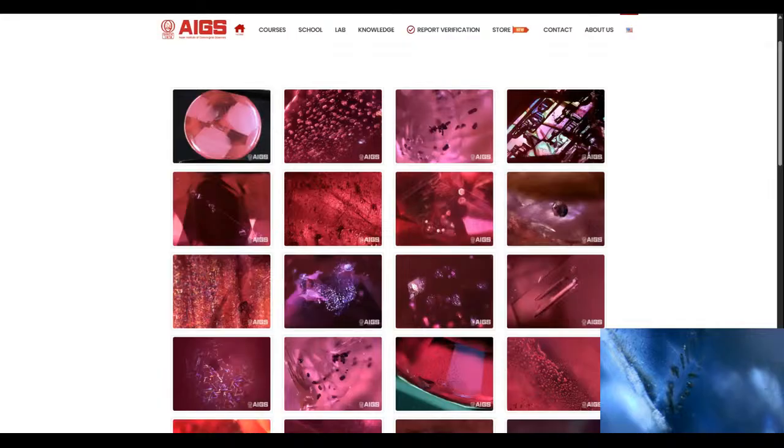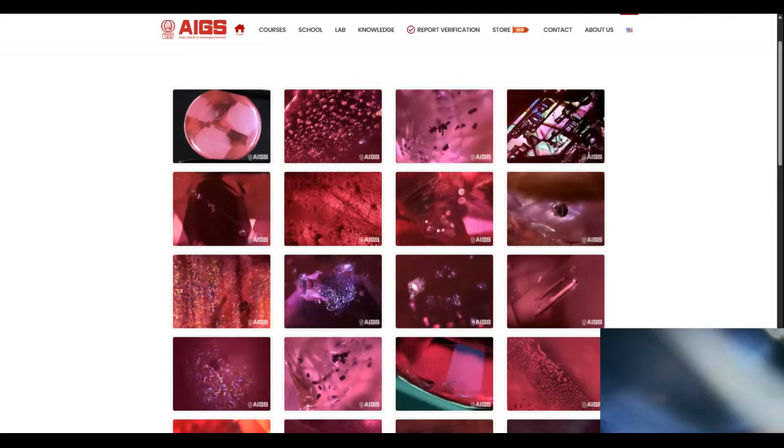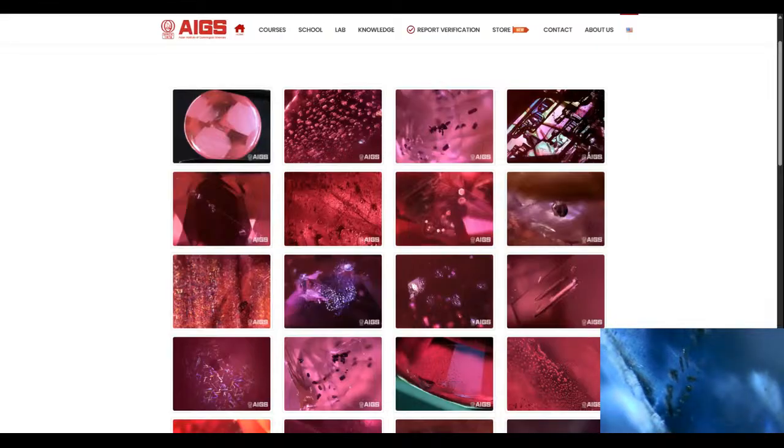Yeah, optical microscopes are obviously better in terms of giving a cleaner image, right? They are much better in visibility, making inclusions visible, but you don't need it. If you show this to a gemologist, you're like, what is this? Wow, that's a clean image. I can tell those are negative crystals that are untouched, and this is an unheated stone. Congratulations. There you have it. This is all you will ever need to know about this inclusion. Of course, I can put this inclusion on the professional microscope, and it will look amazing. But I don't need it. For what? This is not a beauty contest. This is about knowing if this stone is heated or not.